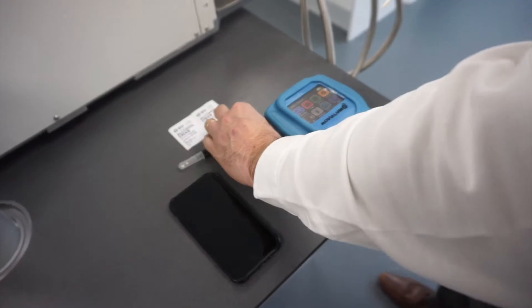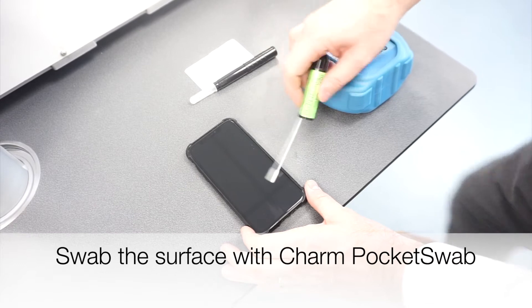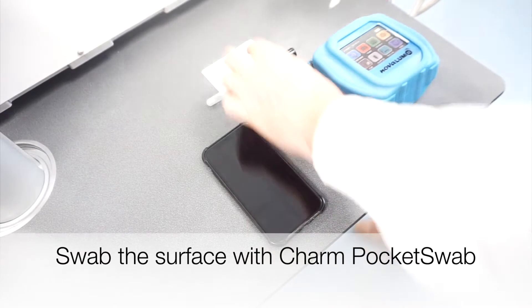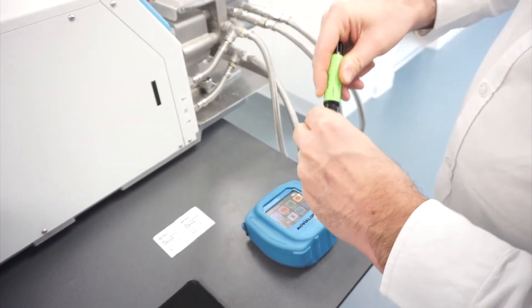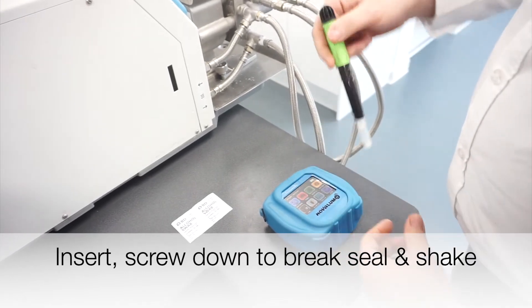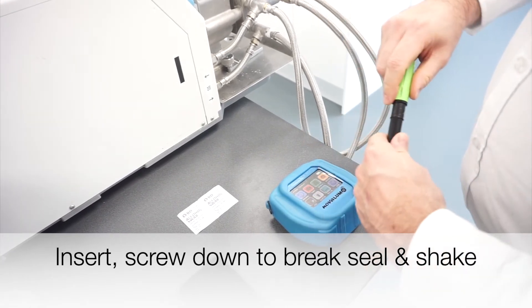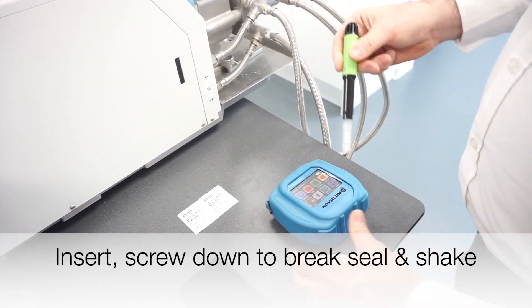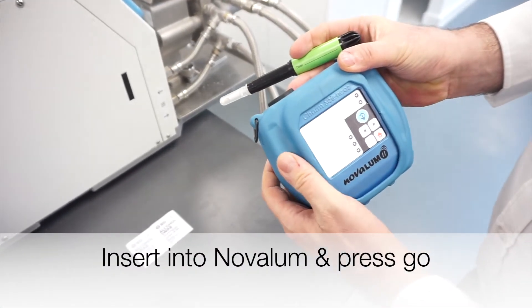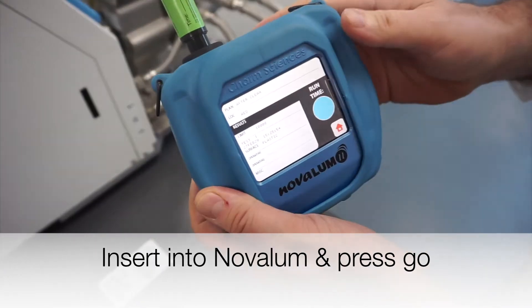So first of all we're just going to swab the surface with the pocket swab, put it back into the holder, then on the reader press insert the swab and analyze.